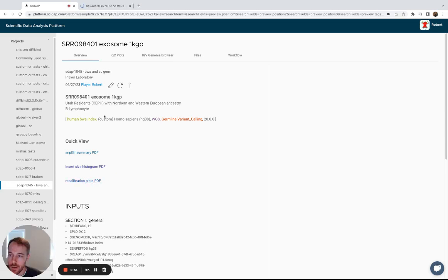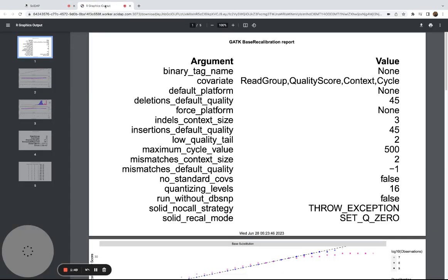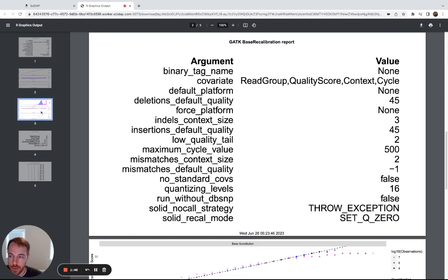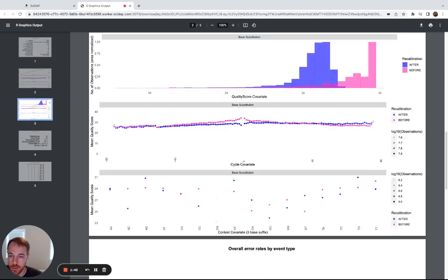Second contains some summary reports for the base quality score recalibration steps.